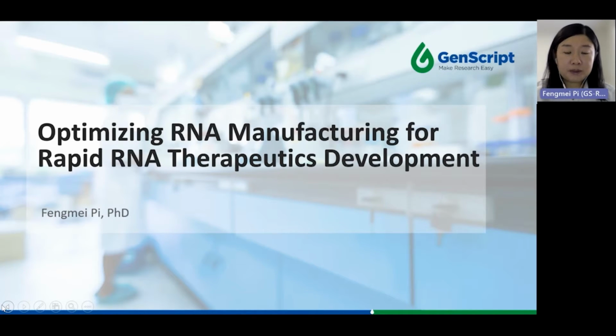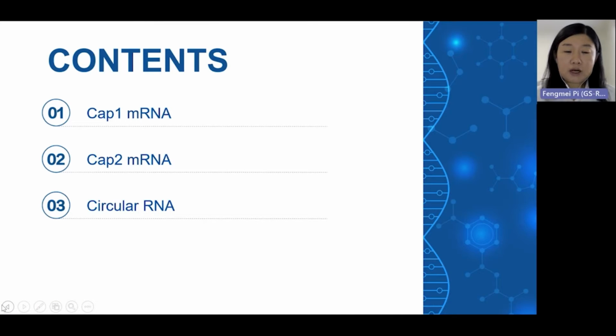I'm going to talk today about how to optimize RNA manufacturing for rapid RNA therapeutics development. My talk today will cover the optimizing of making Cap1 mRNA, Cap2 mRNA, and circular RNA.